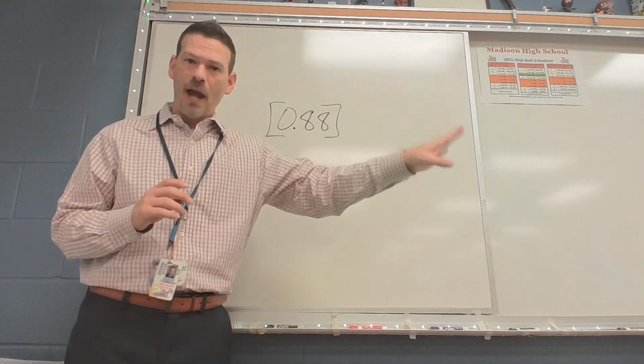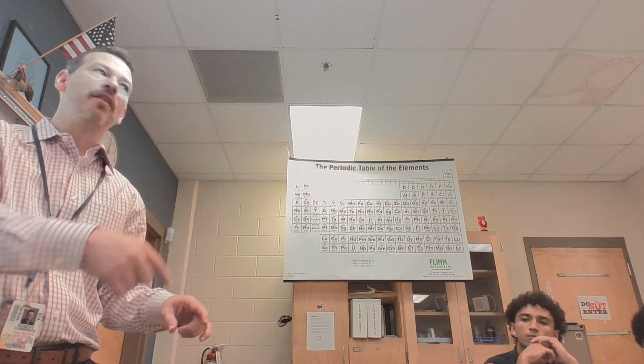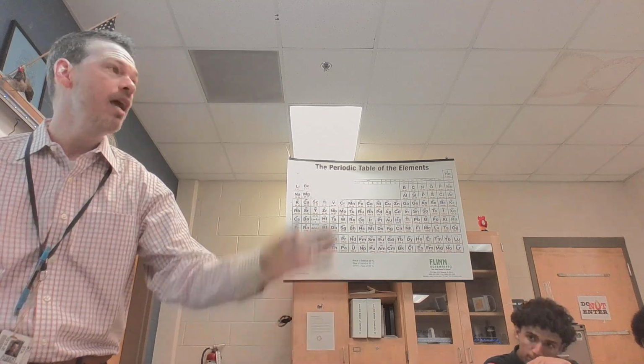Now, that reaction that I showed you, if you want to see another cool thing that it can do, if I can get this angle right, as I stop the kinetic movement here, it's going to cycle back through the colors in reverse.